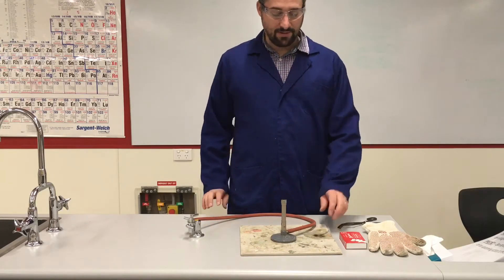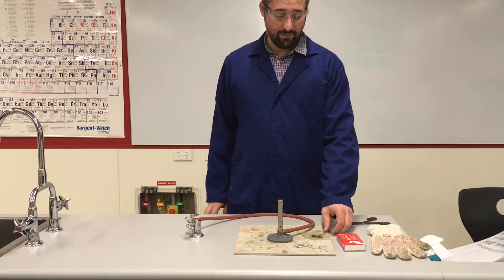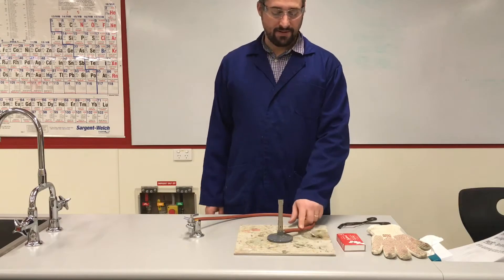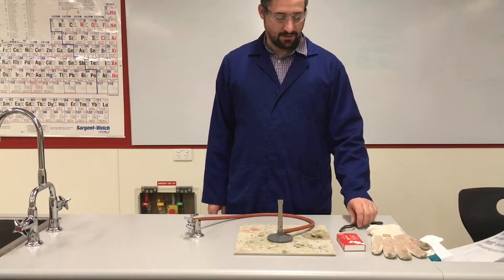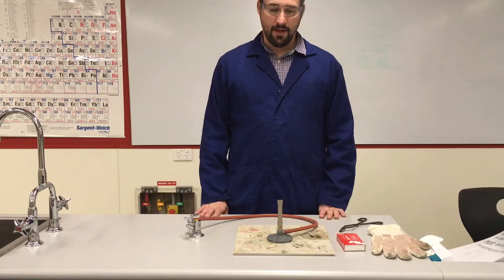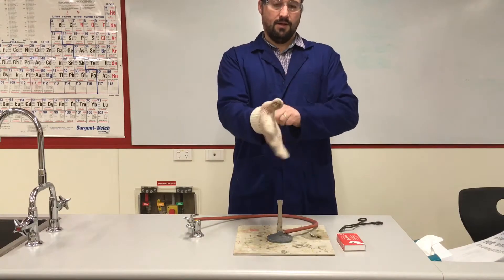Hello, today we're going to be doing a reaction where we will be heating some magnesium ribbon over a Bunsen burner. It's going to give you a very interesting reaction, so let me get started.